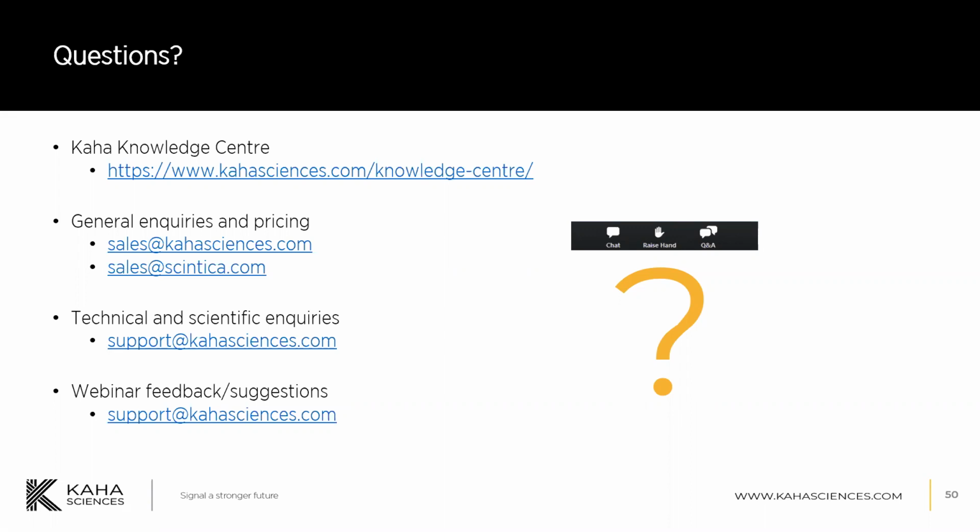That makes total sense. This next question is quite interesting as they ask, what other tissues has oxygen been measured in by telemetry? Yeah, so all of the published work I've seen has been in the brain and then the kidney. I do know a group that tried to measure oxygen in cardiac tissue in the heart, but as you might expect, they found the signal to be quite noisy, probably due to the movement of that beating heart. Too fast, it just wasn't feasible.